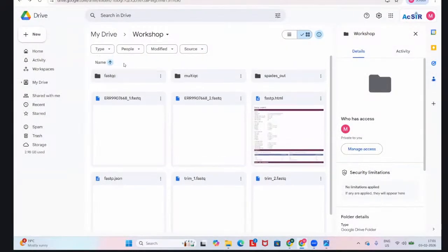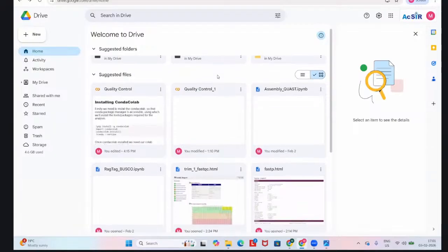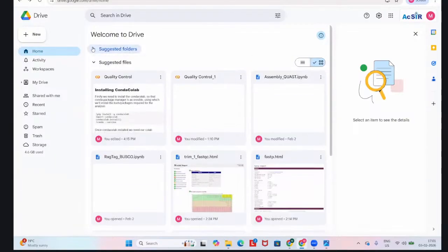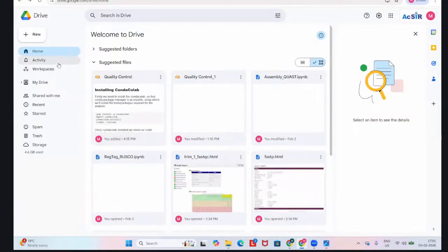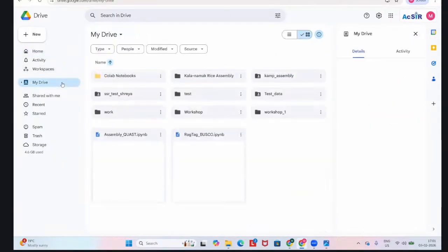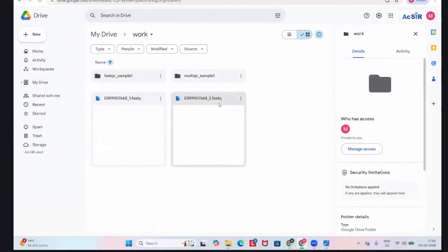So I'm in my drive. Here I will find the work. I will go into my work directory. Sir, should I execute from starting?